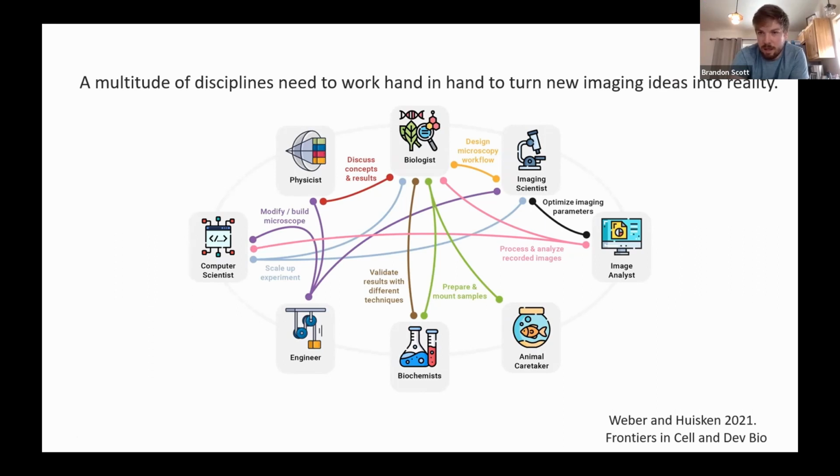So if you want to, I would very much say, let's have this be interactive and ask questions along the way. I'm going to get that out of the way. This is just an attempt at showing some of the different things that we're doing in my lab related to image analysis. So it walks us through from the start, a little bit in terms of how we get from the raw data to the finished product. And then I would like to try and show some of the things that we do in Chimera. This is the part that might be more streamlined than it might be, but we'll do there.